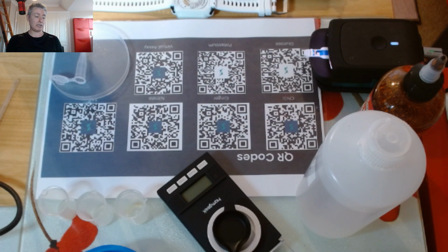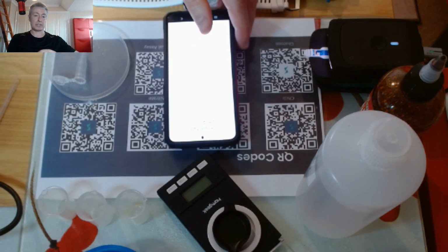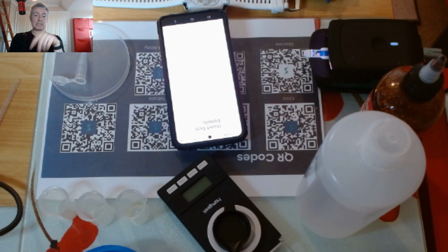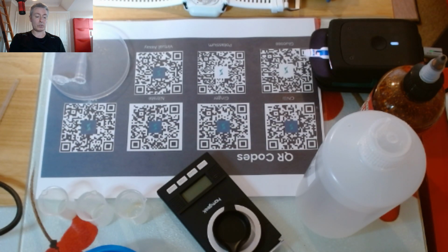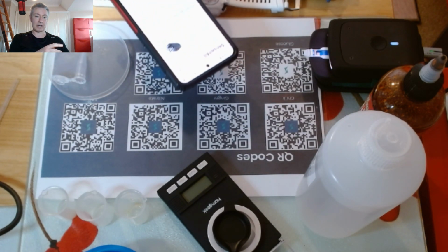Next thing I'm going to do is put some details into my app, because I want to tell my app the sample ID and where to save the data. Something that's not necessarily super clear, because I haven't discussed it, is that every time we do a test, you get the result on the phone, and the result also goes to the cloud. So let me put a quick word in here. I'm going to call this test toxin 1. I'm going to put it under what's called a cluster, and I'm going to call that cluster demo. Right, so that is done. I've put those two details into the app now.